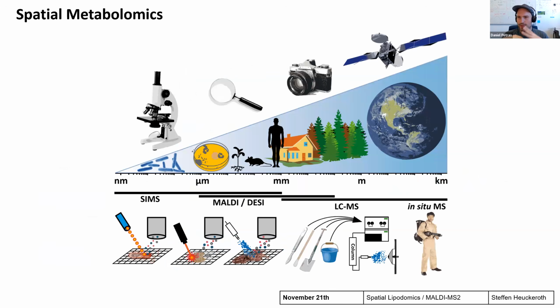So this was for the LC-MS part, but obviously, as Alegra mentioned, there are many more technologies than just ESI-based LC-MS/MS. In particular, for spatial metabolomics, there have been tremendous developments in the field, and now you can also do MS/MS in some of those MALDI-based spatial metabolomics experiments. So I'm very much looking forward to having Stefan Heuckeroth give a seminar on spatial metabolomics, and particularly the use of MALDI MS/MS-based imaging.